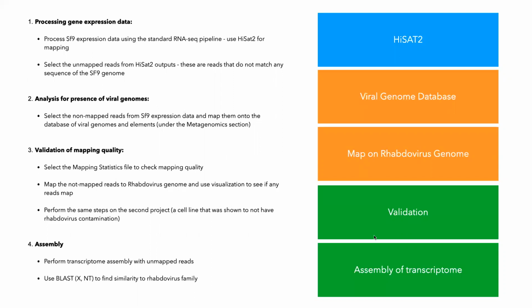Okay, so has anyone looked into the SF9 project? Okay, great. So please take a look at the project, see what's in there, try to replicate some of the steps, see if you understand how the mapping results could be interpreted, and try to think of how the same principles could be applied to the discovery of the novel coronavirus, for example.